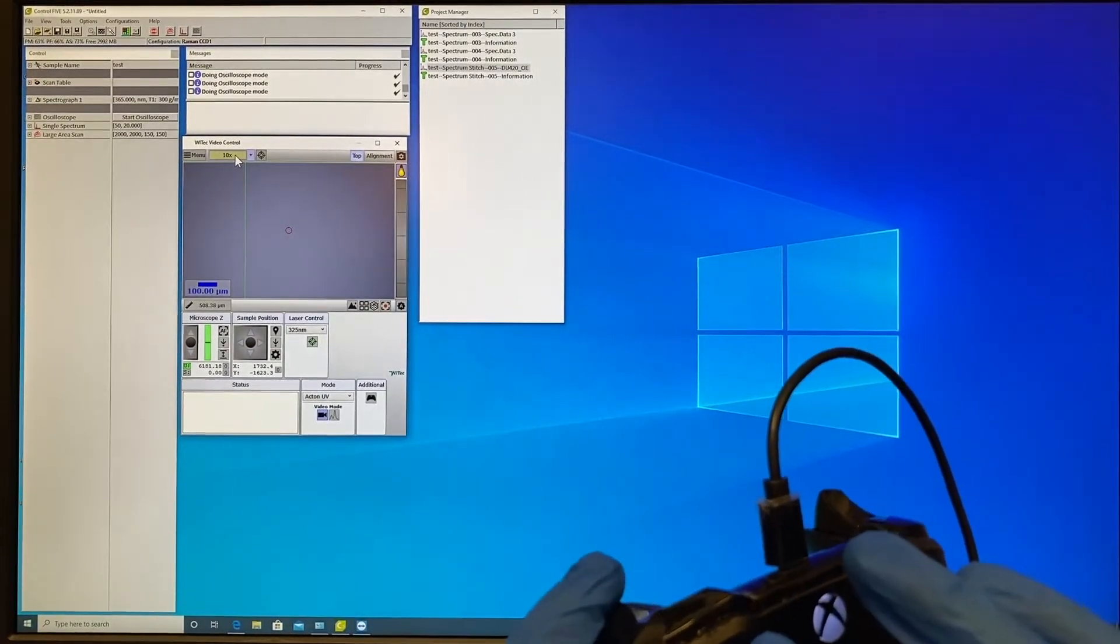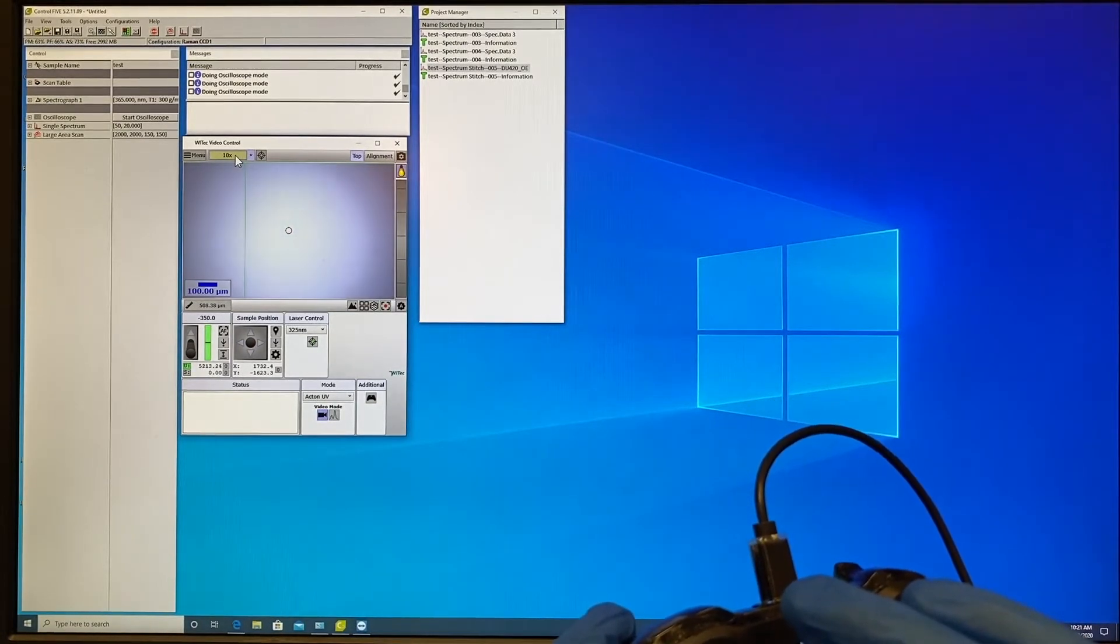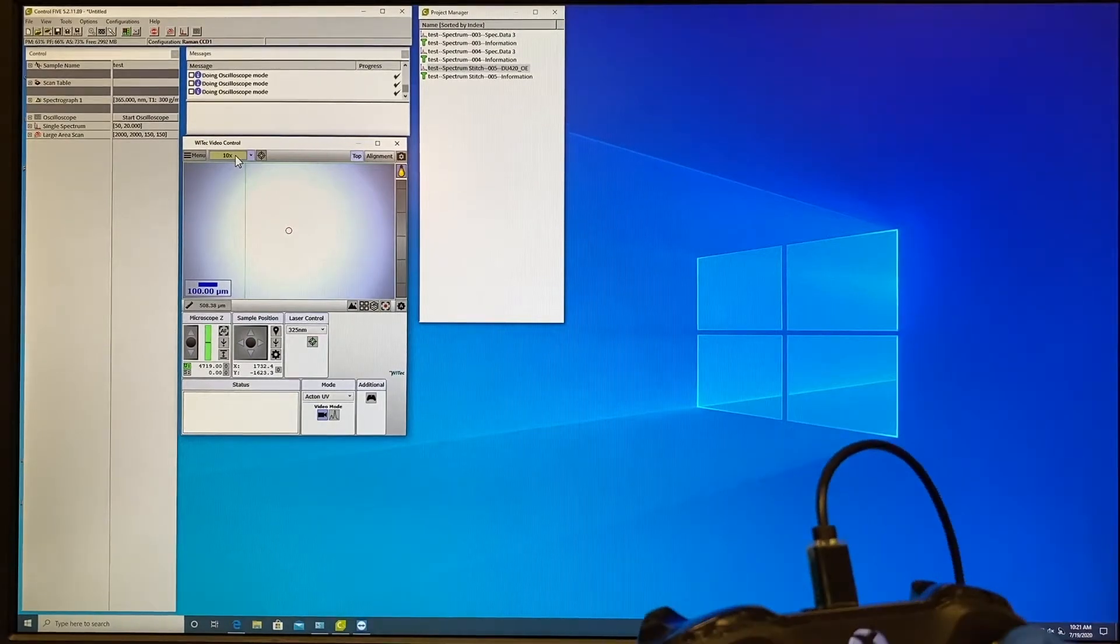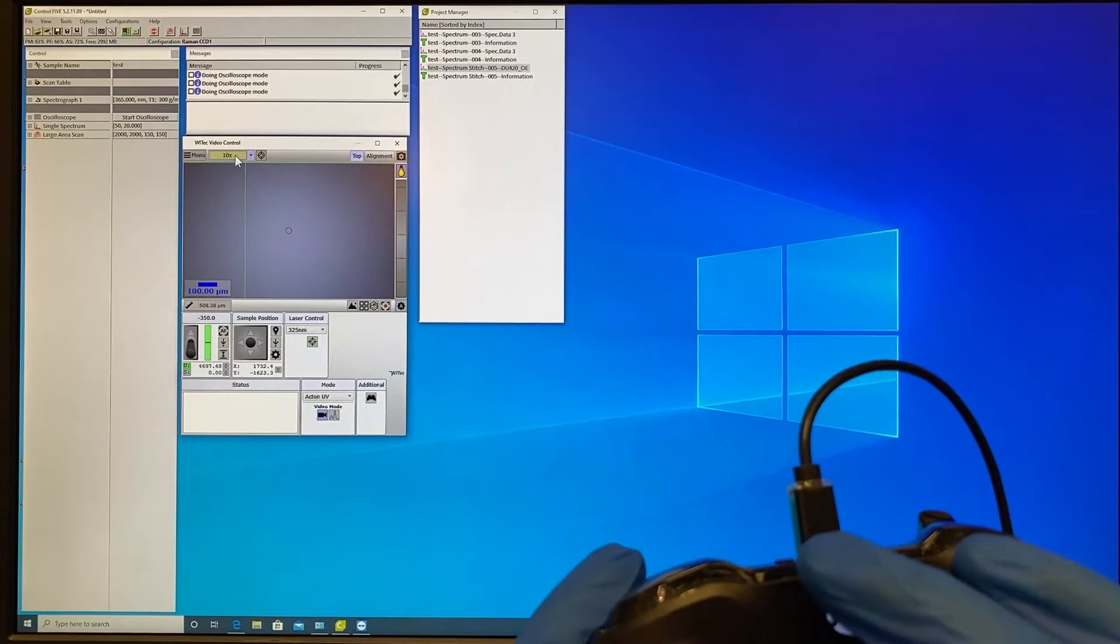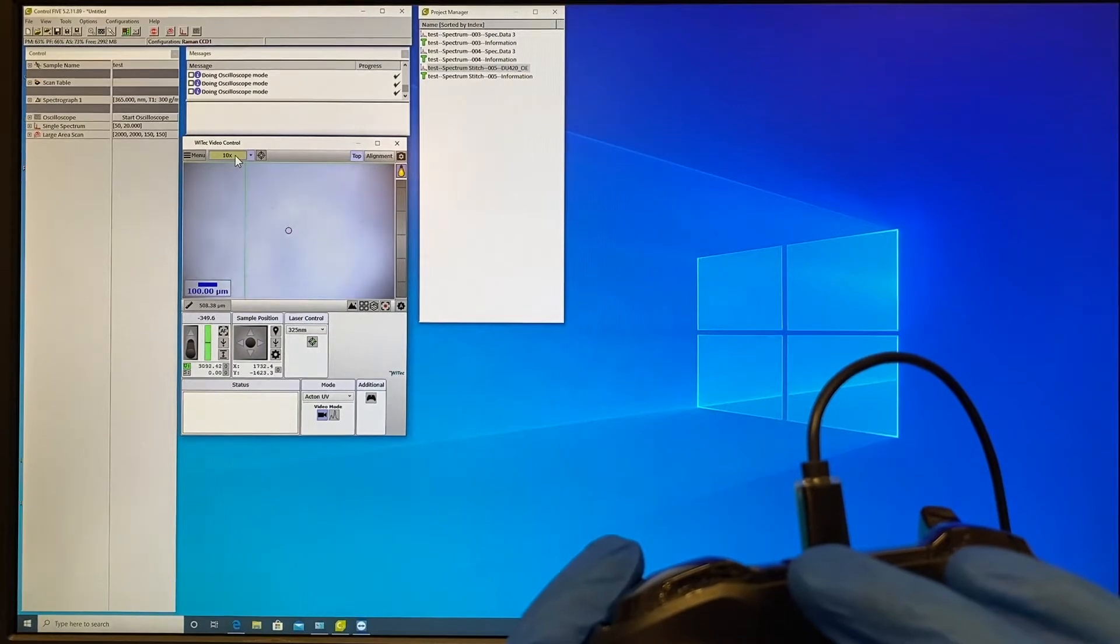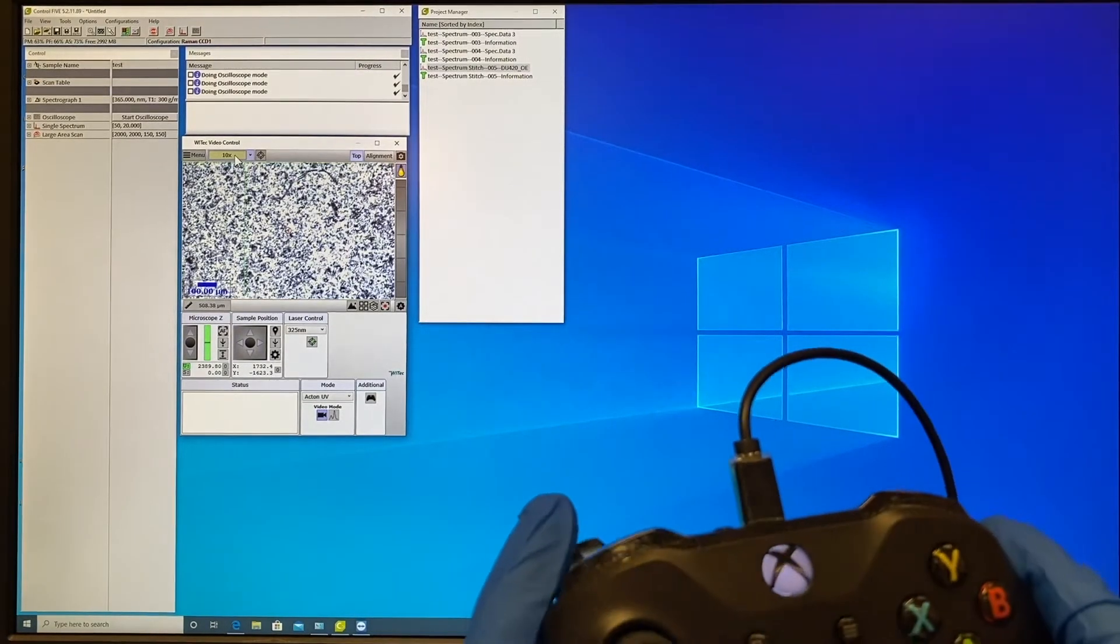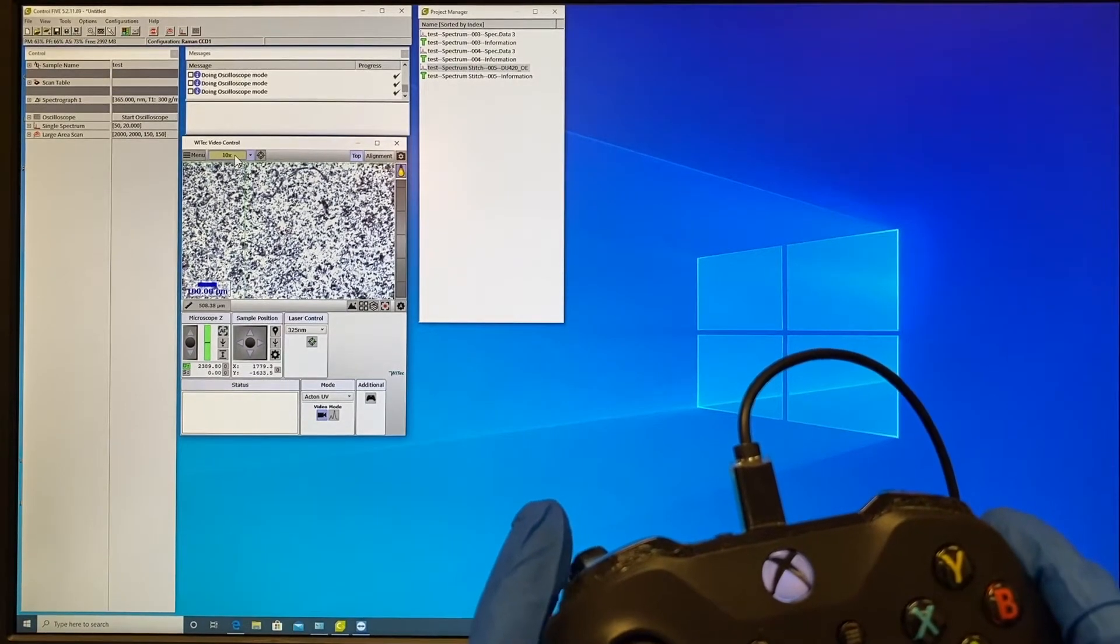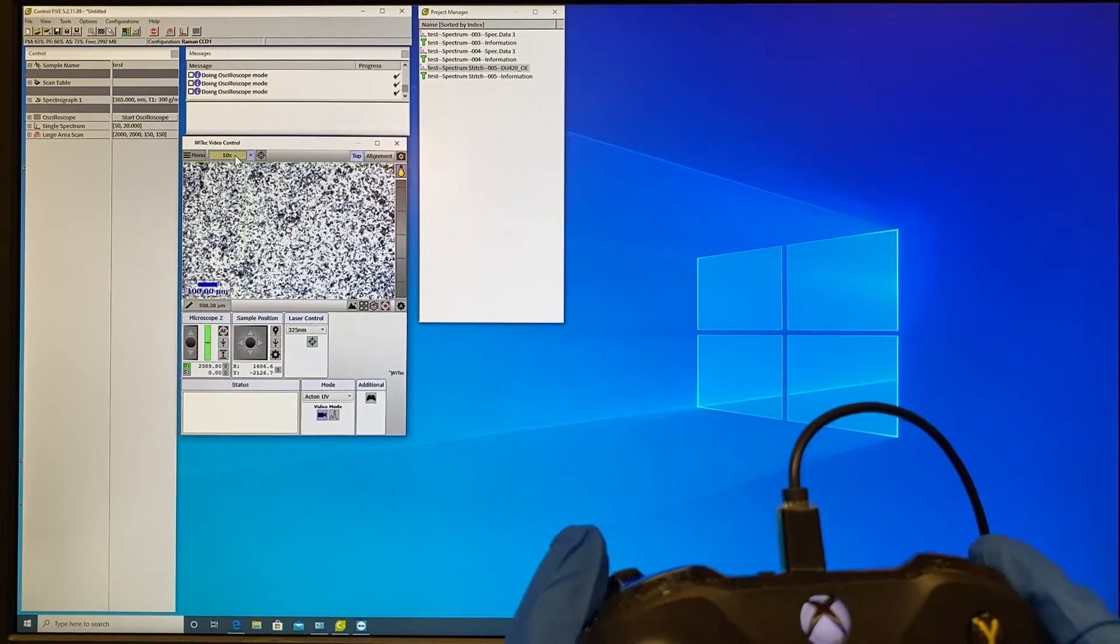You may use the turbo to make it faster. You can see that the background starts to be too wide. You can use Y button to auto brighten it. You can continue to focus on your surface by going down. You may see that something might appear. You check if it's surface, it seems it moves. So this is the surface of our material.